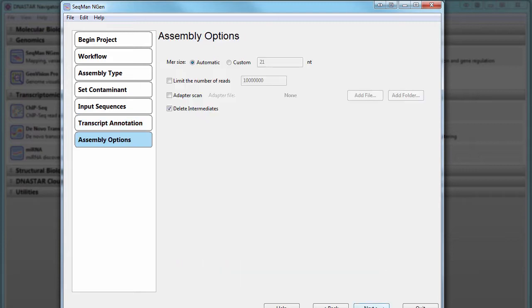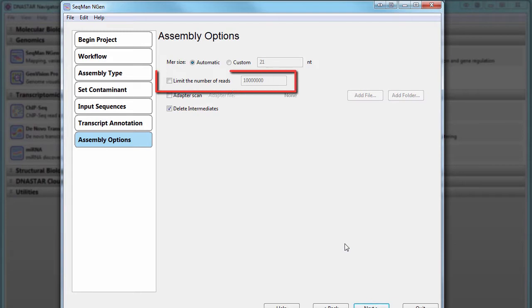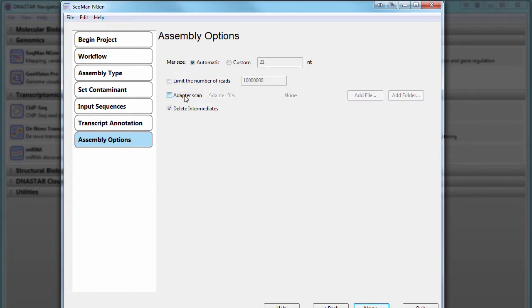Now review the assembly options. If you have limited RAM, you may want to limit the number of reads in the assembly. Here, you can also scan for adapter sequences by checking this option, and then load in your adapter file.